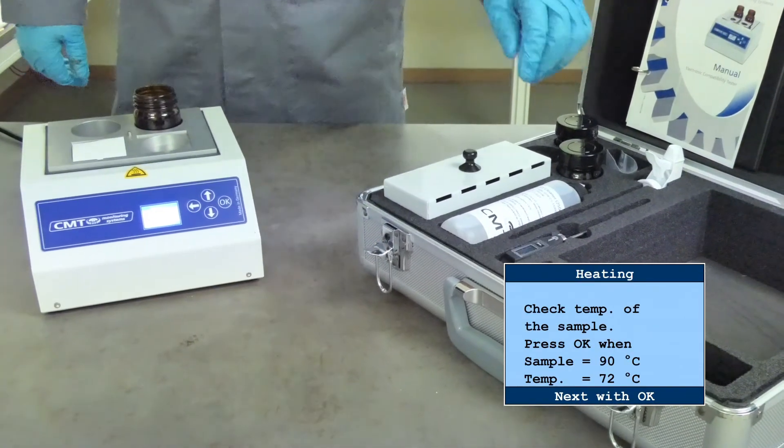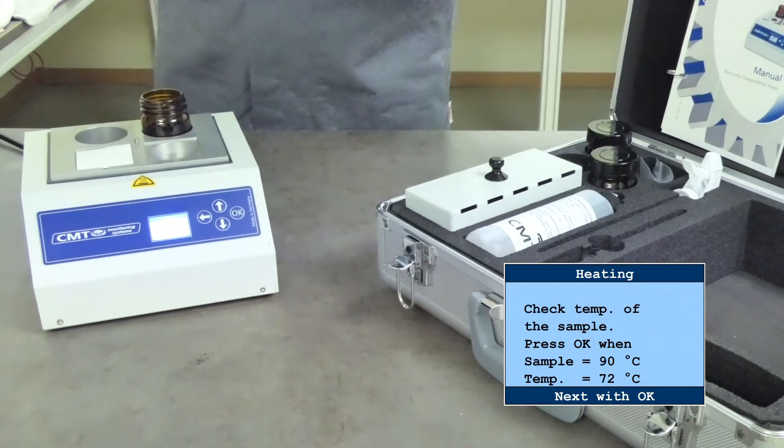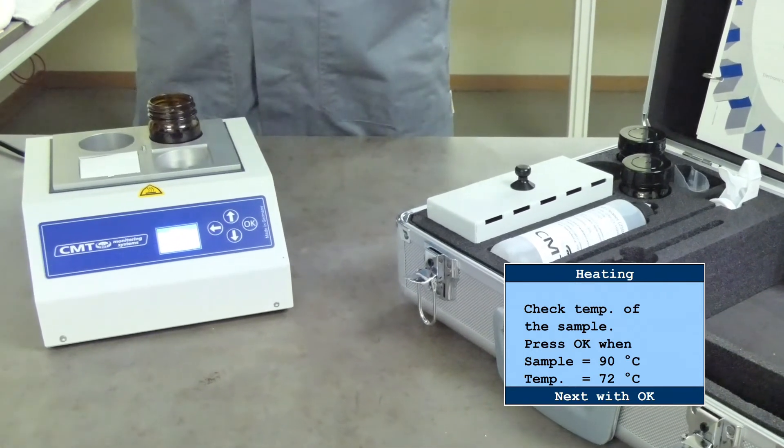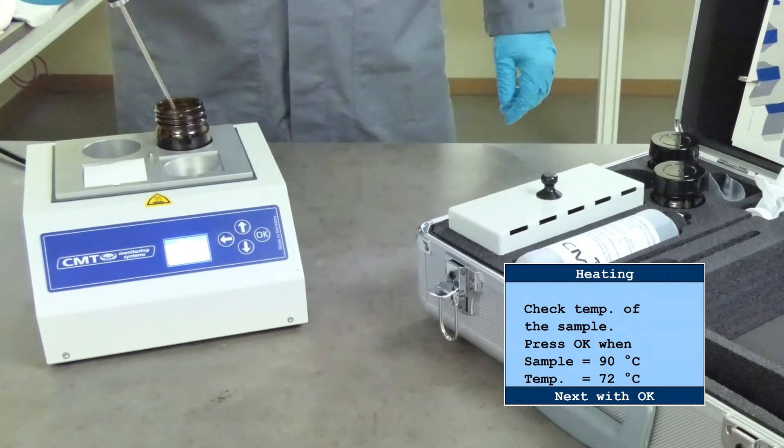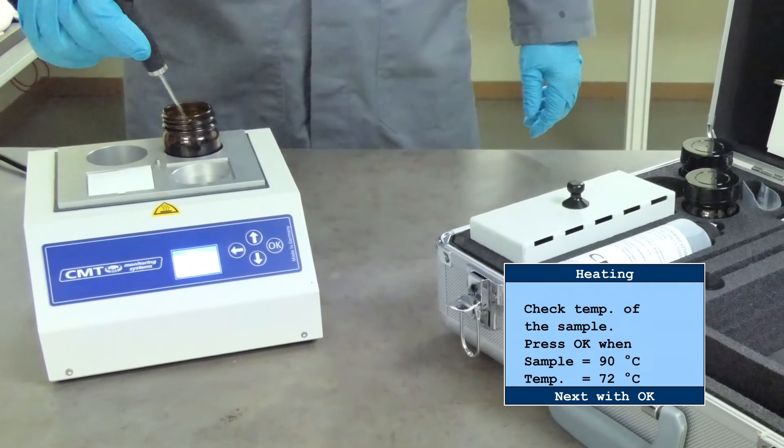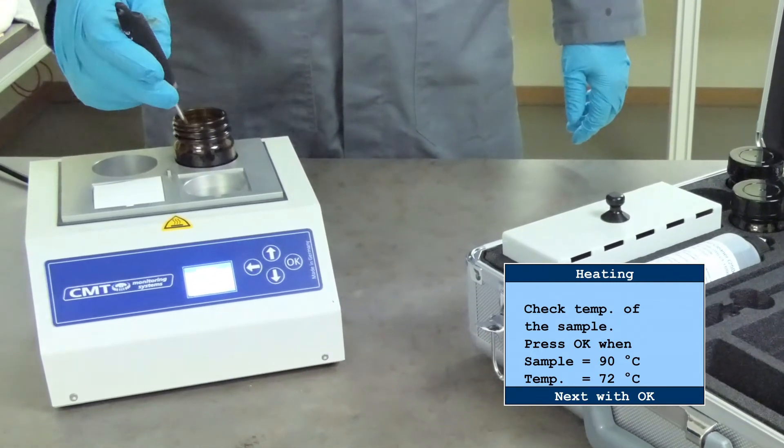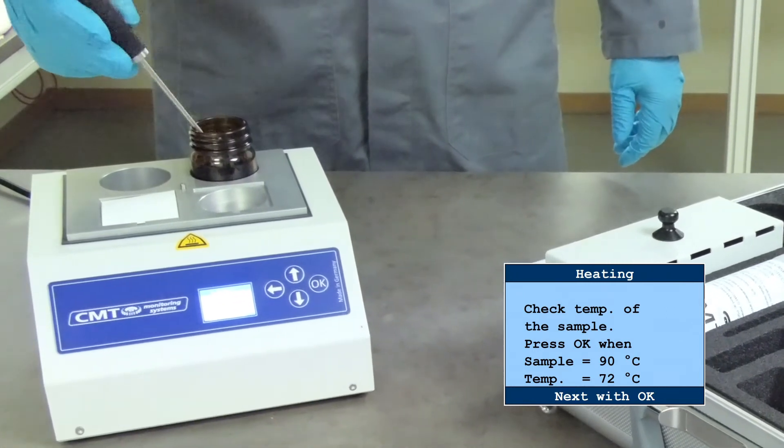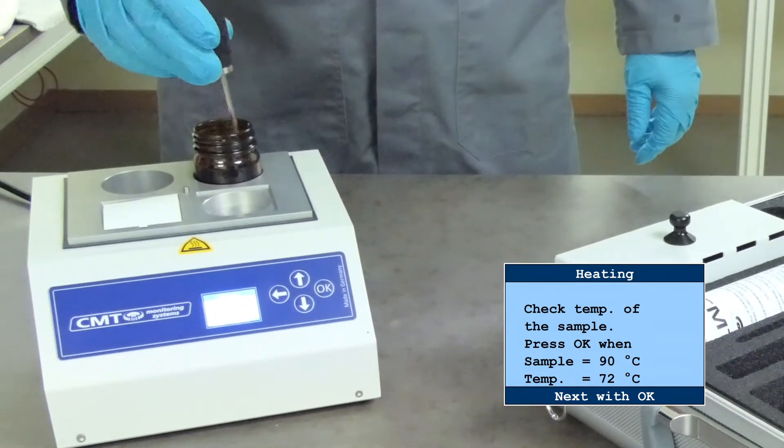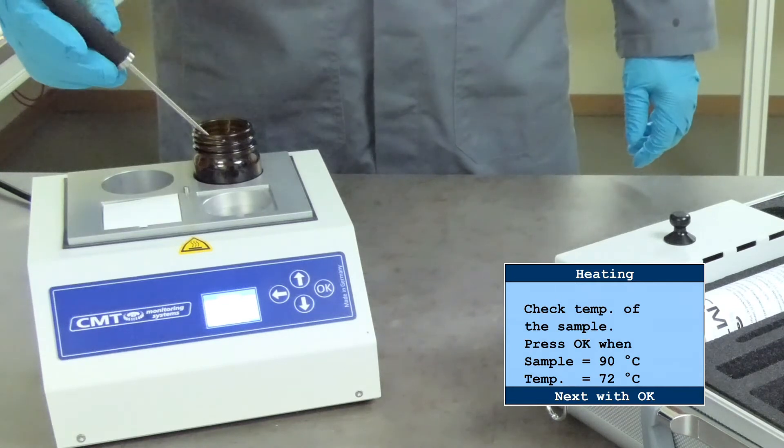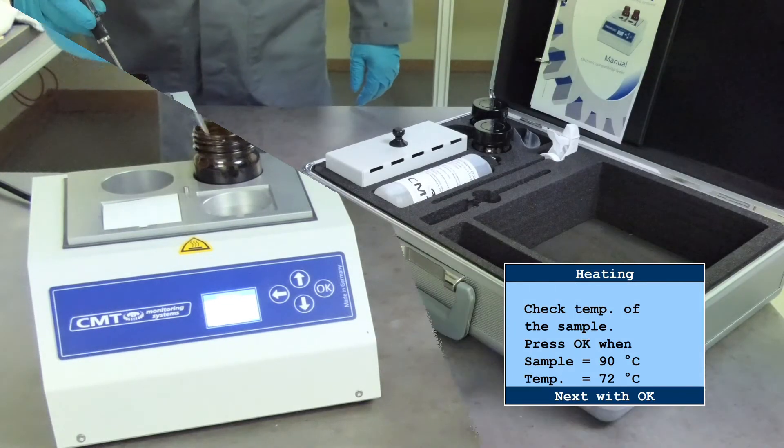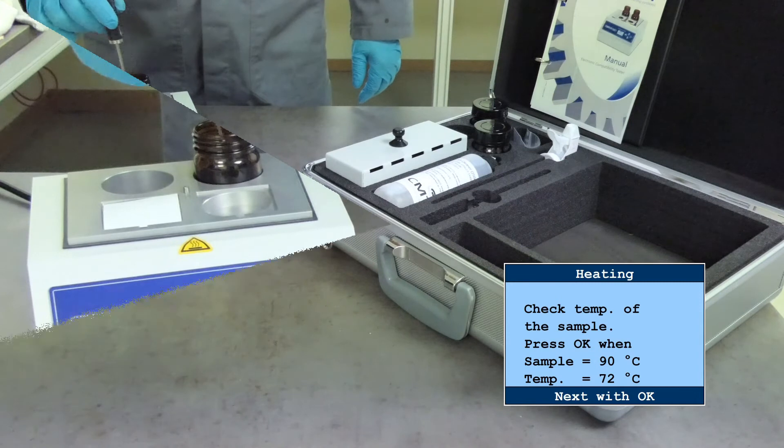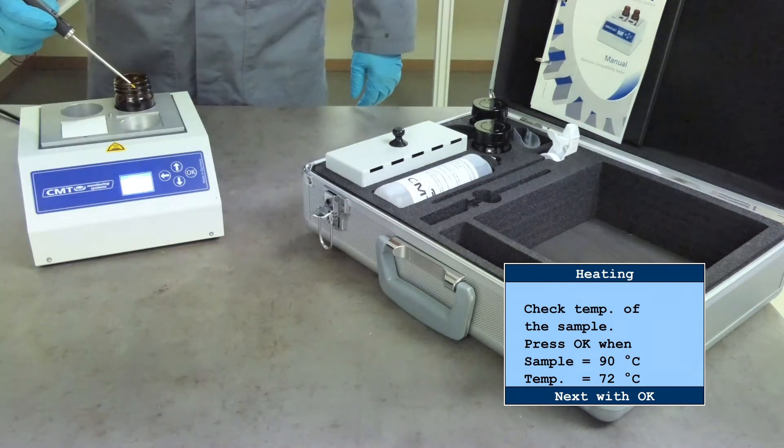Heat the sample evenly by stirring the sample with the thermometer and check temperature occasionally until a temperature of 90 degrees is reached. Please note, the display indicates the temperature of the heating plate only. Use the thermometer supplied with the kit to check the sample's temperature. Press OK when the sample has reached 90 degrees centigrade.